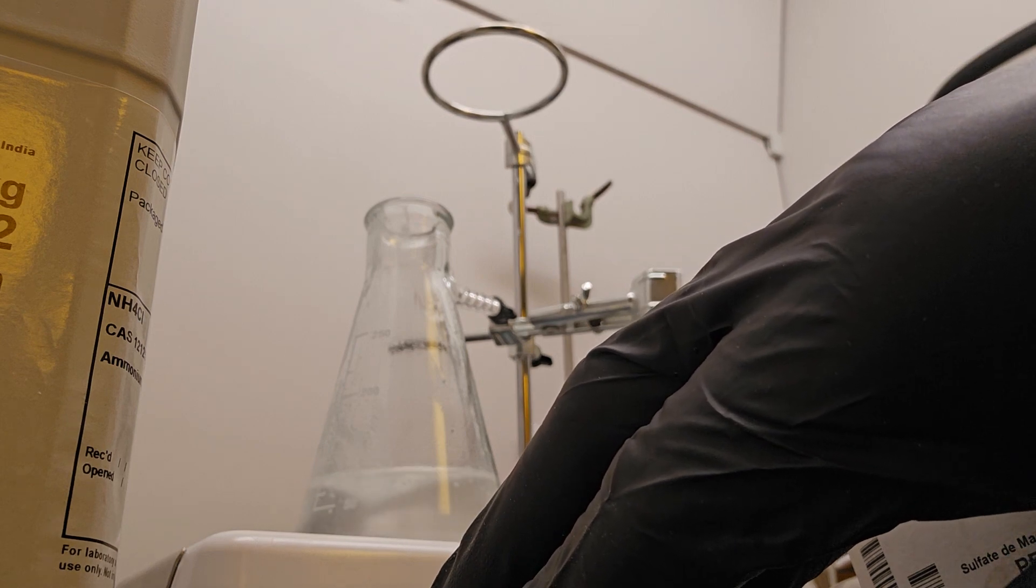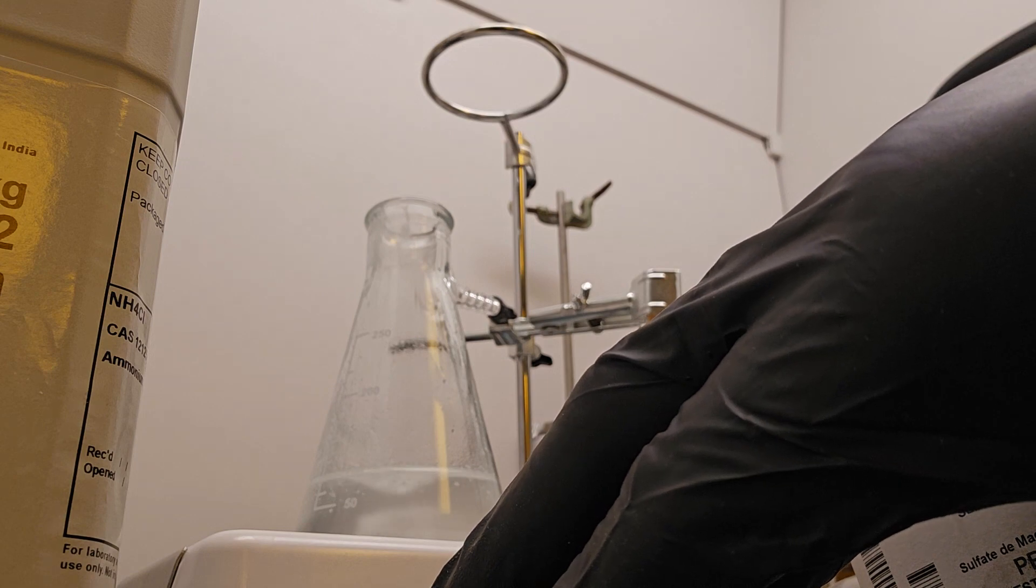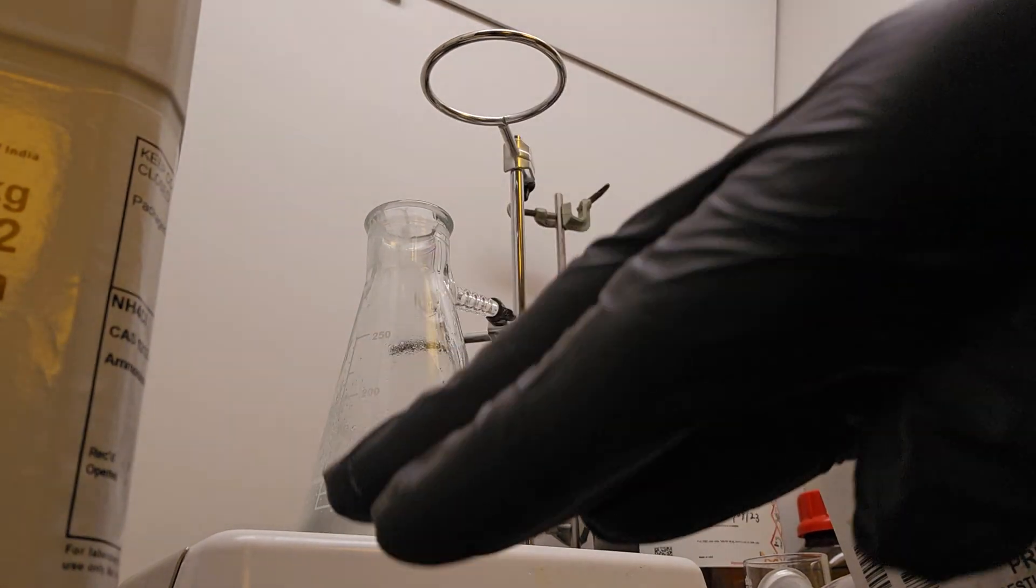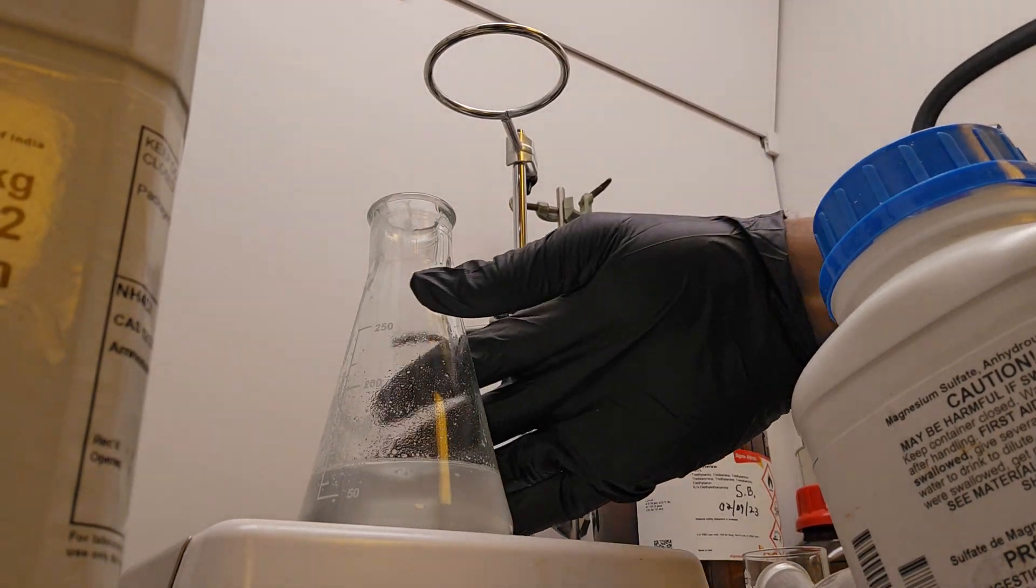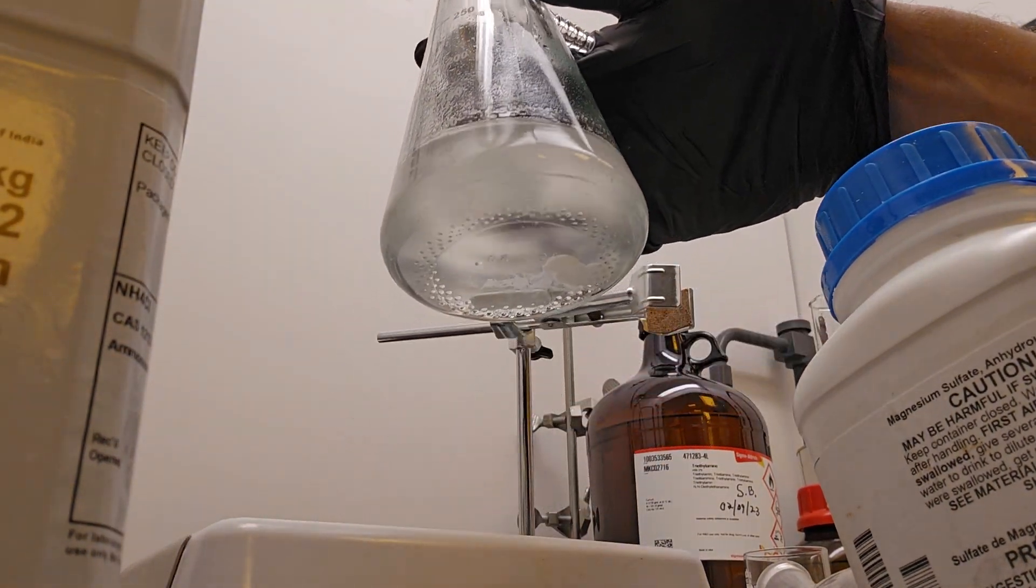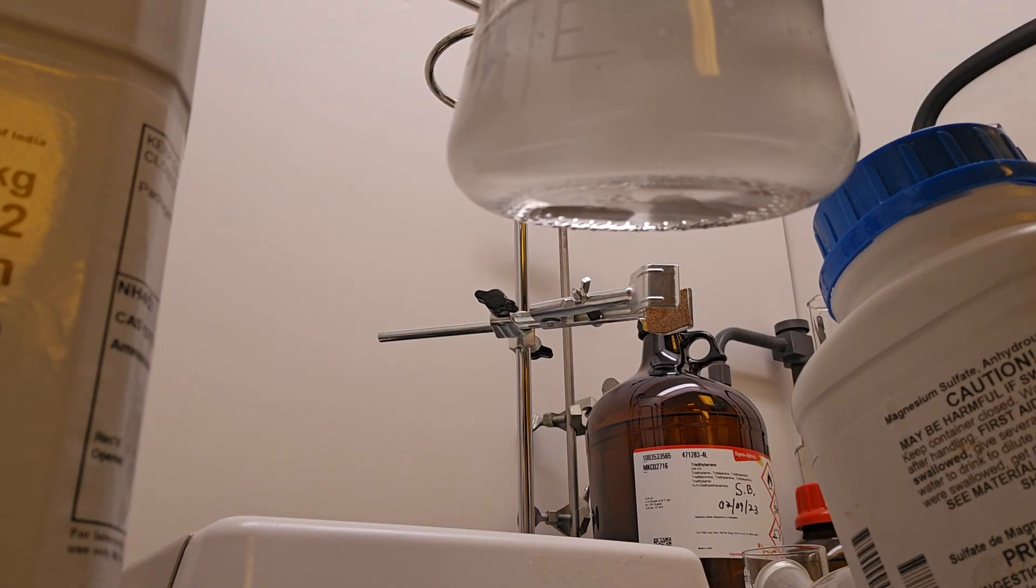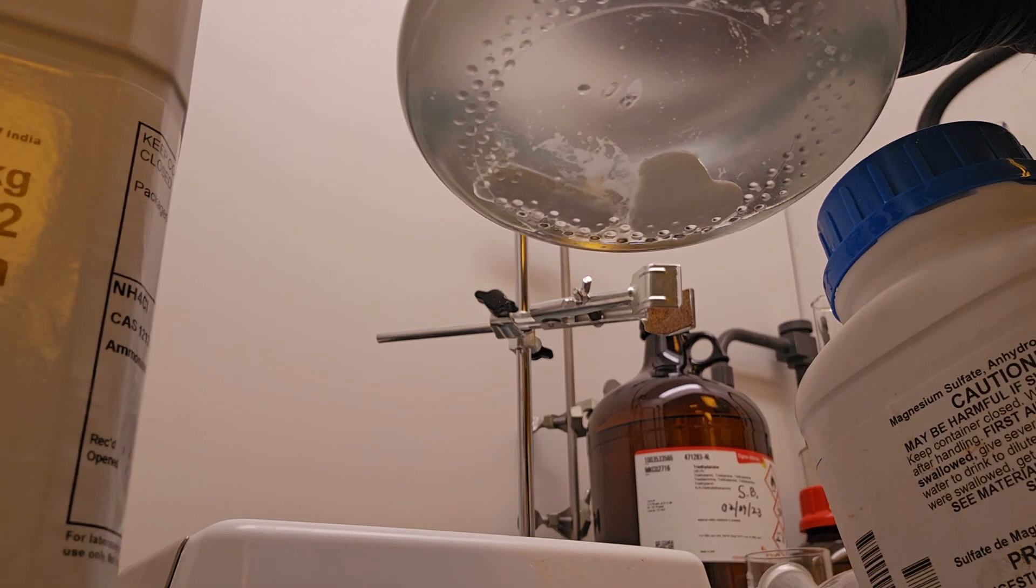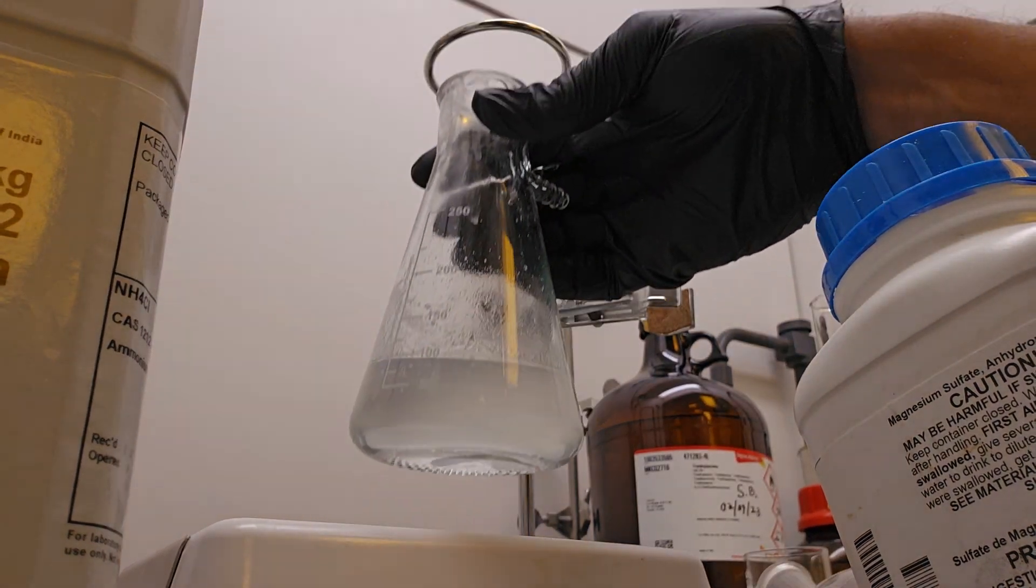Again, this is convenient because all we have to do now is filter out this clump. And so let me show you here so we can get a good view of that clump underneath it. The clump is next to the stir bar. So there you have it.